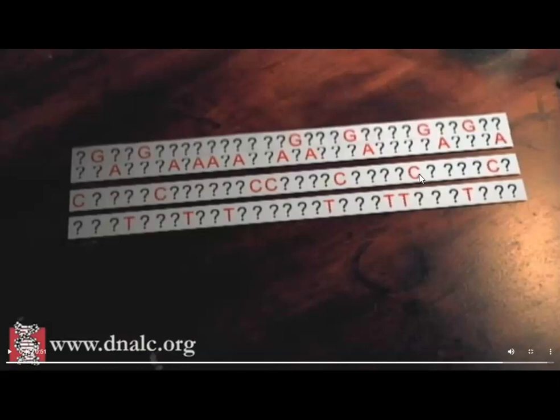So we have different fragment sizes which the machine can recognize, and they are all put together, analyzing where is the C, where is the A, and where is the T. The machine automatically puts them through software inside the machine, and there is a computer connected to the machine, so everything goes together, and just like boom, that's magic, so you get your DNA sequence. Let's continue.